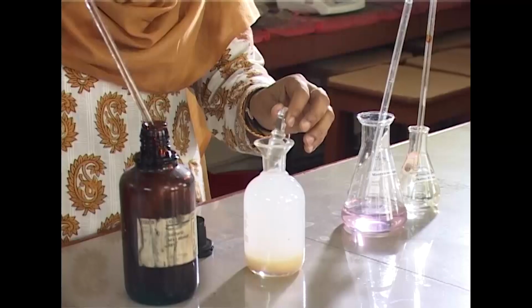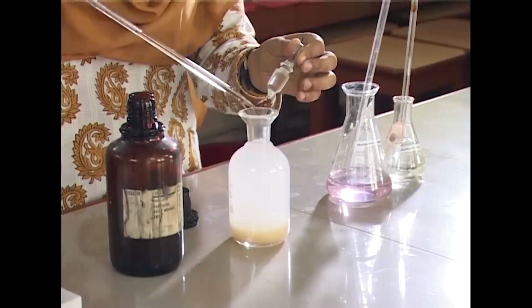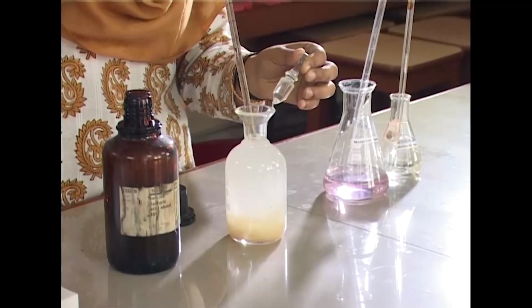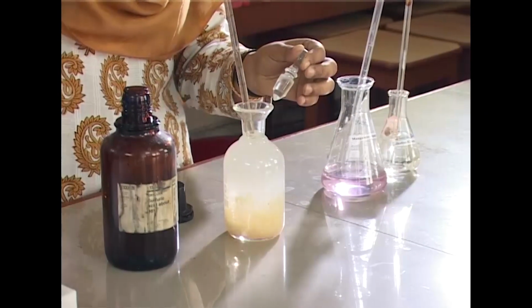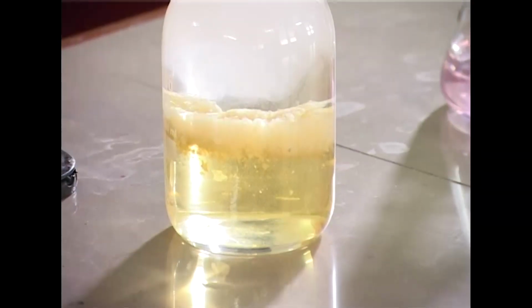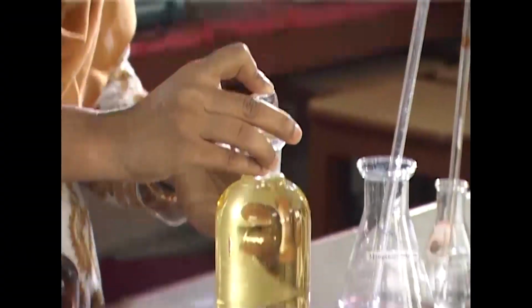After this precipitate settles at the bottom, we add about 2 ml of concentrated sulfuric acid and the precipitate completely dissolves. And there is the presence of potassium iodide, which breaks up and releases free iodine, and this free iodine has to be measured for the assessment of the oxygen.